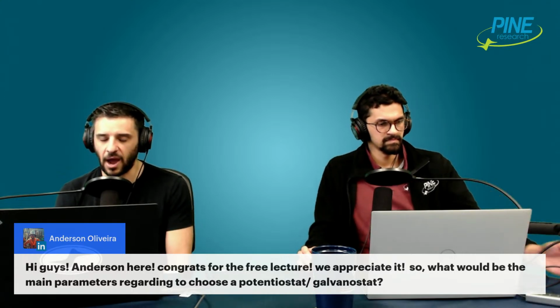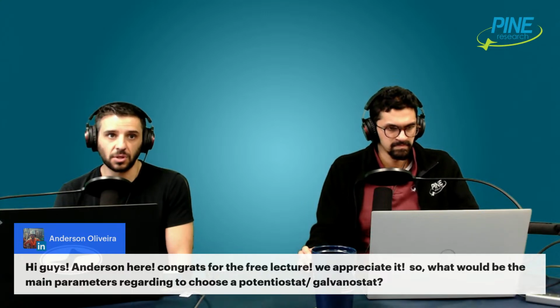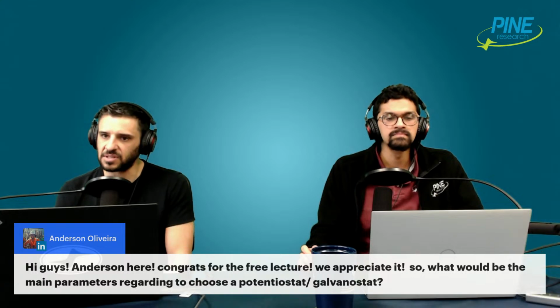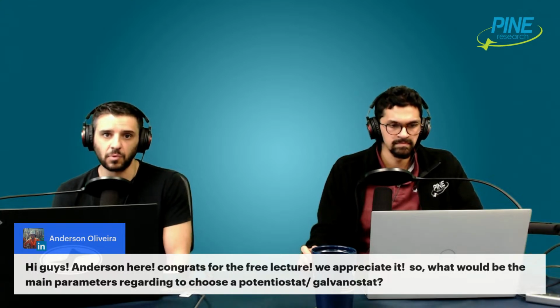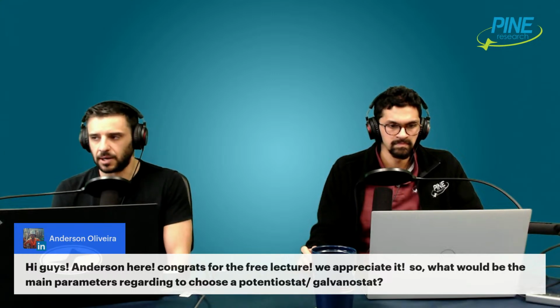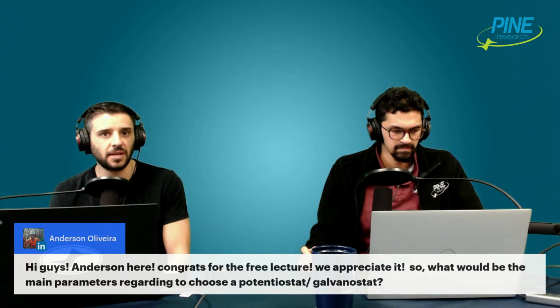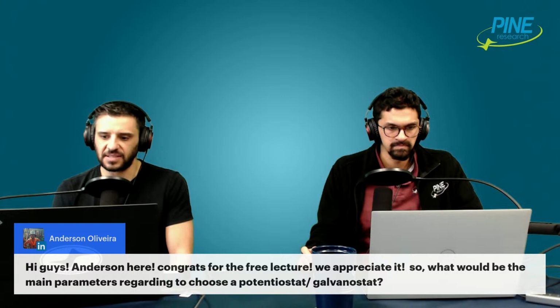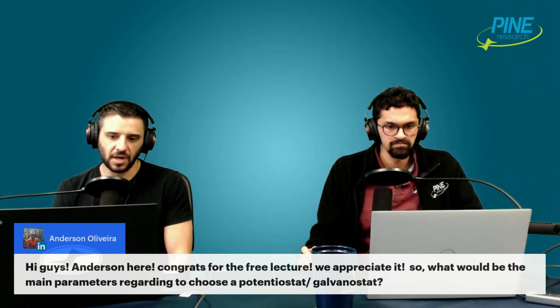And then, how well it allows you to do what you're looking to do. Because if you're looking to do just a couple of CVs, something very, very simple, and maybe perhaps less expensive, will work. If you're looking to do pretty complicated scripting and a lot of triggering and sequences of experiments, you might need something a little more sophisticated, or at least a software program that allows you to do some of those fancy things, I guess. But that's just a general overview, I guess, for you. Do you have anything to add?